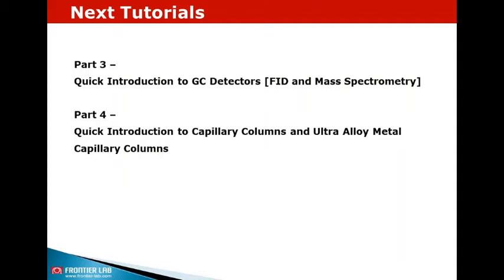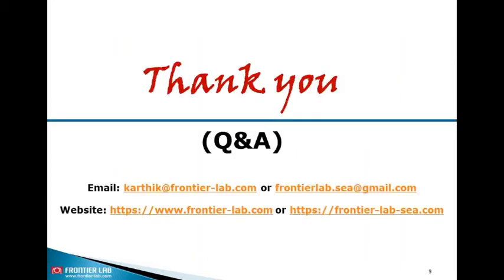In the next tutorial we will learn about the different types of GC detectors, and after that we will also learn about the capillary columns, including the ultra-alloy metal capillary column that is produced by Frontier Lab.